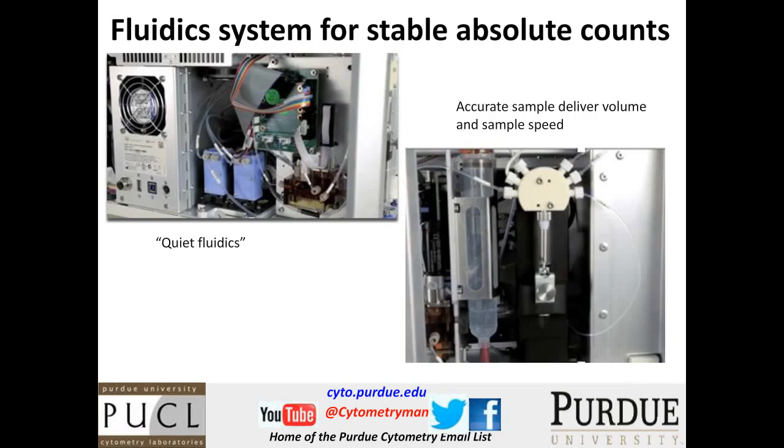And over here is the syringe. So this is a syringe, and you put the sample into your sample tube, and that's somewhere over there. It's sucked into a sample volume, and you might wonder why there are all these parts in this system. But this valve is a fairly complicated valve.